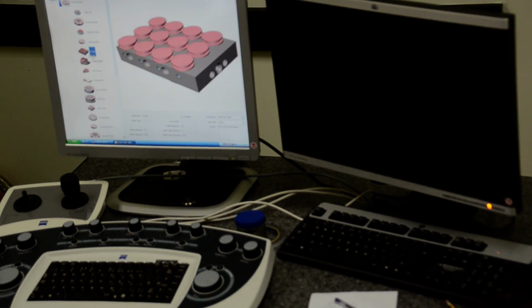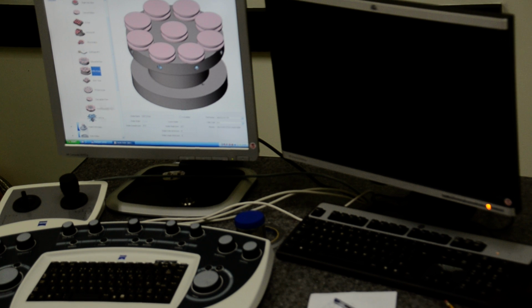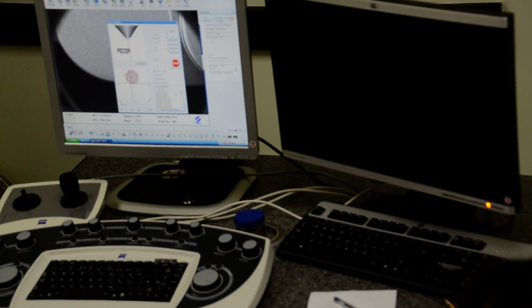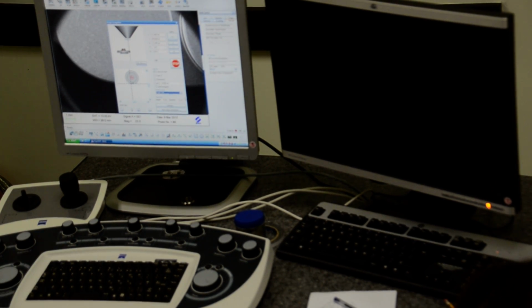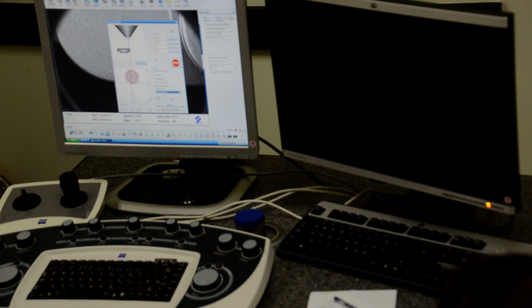Yeah, you have gel, they have this kind of tube sample holder, they have whole stage sample holder. Then over here you have the single stub sample holder already. So you just enable it. Yeah, we just go to the one we are using. This is a 9-stub sample holder.